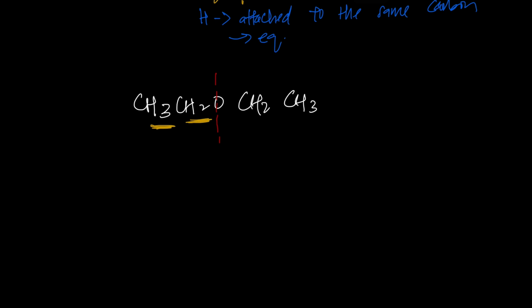So maybe I change the color so it's easier for you to read. Okay, so this three protons here are the same as these three protons. So in total, 6 protons, they are the same. They give you one signal here.